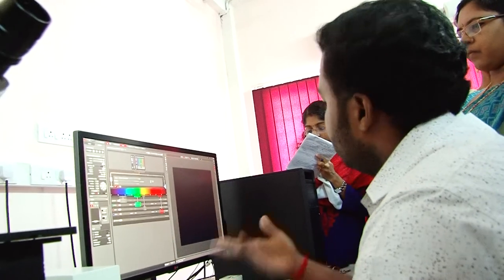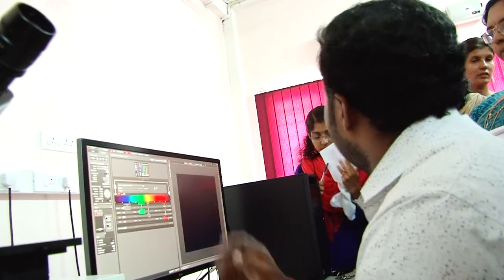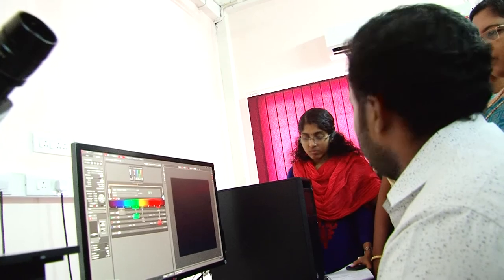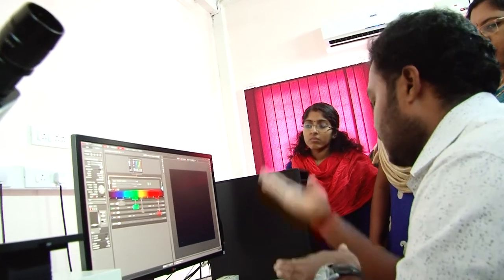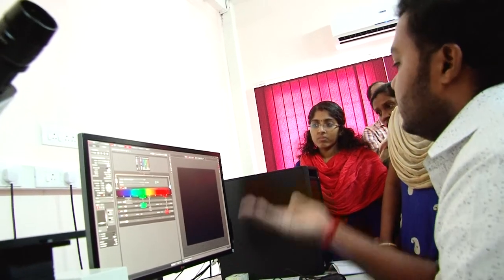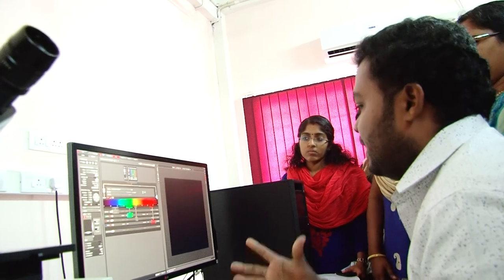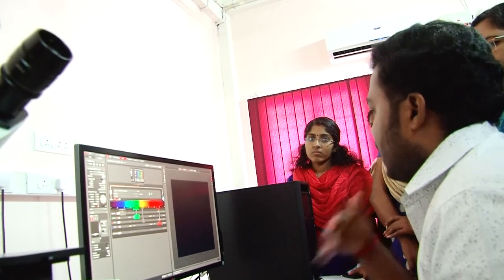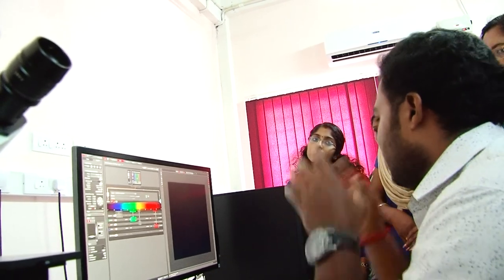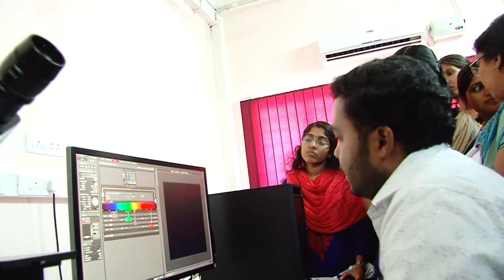It gives the values in the micrometer range for the Z movement. We must set the two limits, then we can just start the scan and it will go and come. I'll show you. It just comes this way, scans all the data, and we can combine it and make a 3D image. It's quite easy, but after taking an image only can we finalize whether it is an out-of-focus area or a focused area, because by doing a single channel only we cannot determine that range.